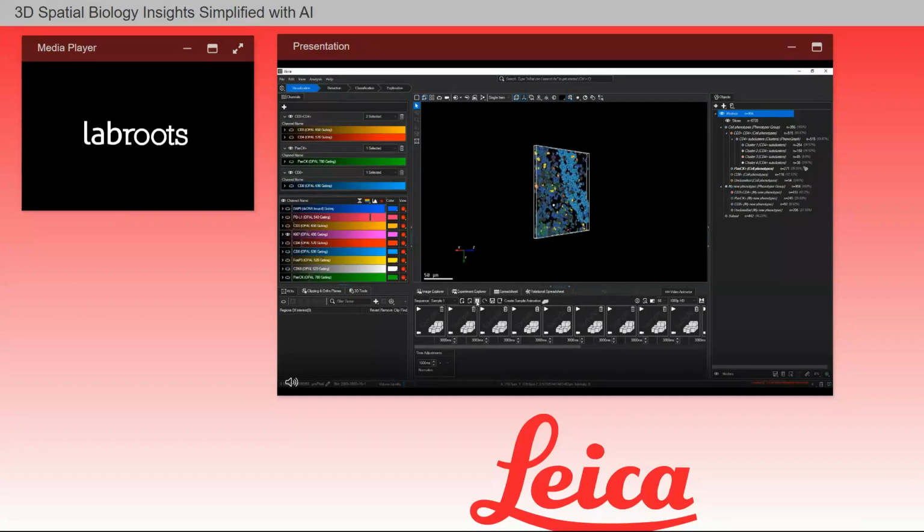Today, we have covered many of the new features of Aivia 14. We showed you the new workflow-oriented user interface. We talked about cell segmentation using 3D multiplex cell detection recipe. We covered the process of phenotyping and cell classification. And we explored different ways to chart and display our data and perform analysis on an image.